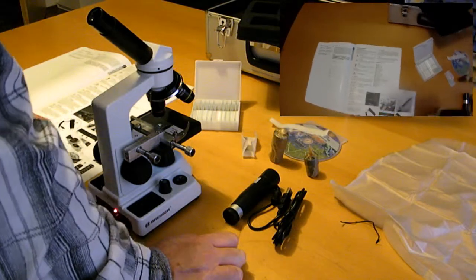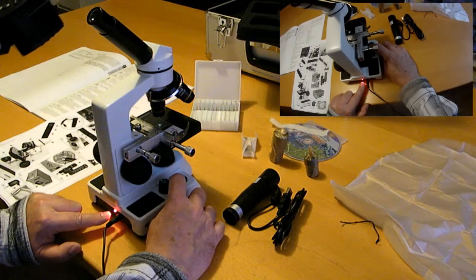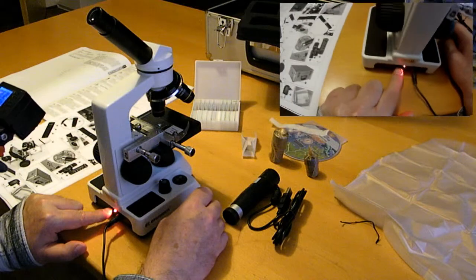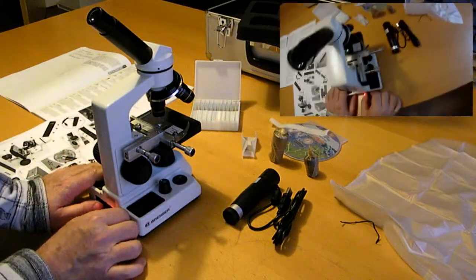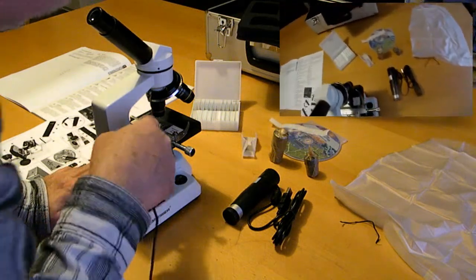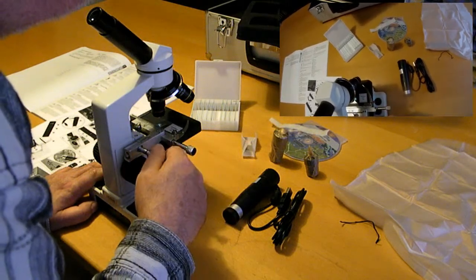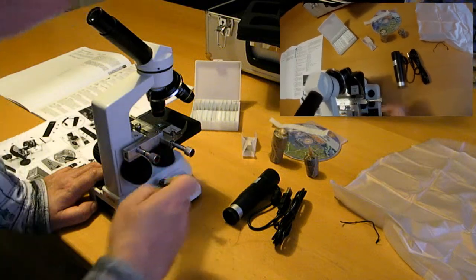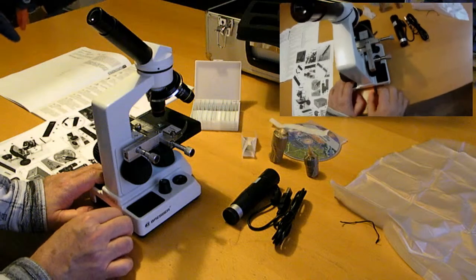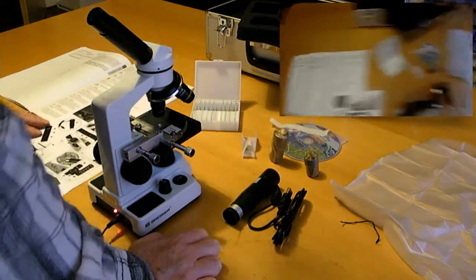LED status, number 21. LEDs, here. What's that LED status? I think something with a battery. Is there a battery? That's a nice question. Yeah, there is a battery. You see the light is still on, but it's not connected to the electrical power. So I think, yeah, clear. And the power supply cord we have.